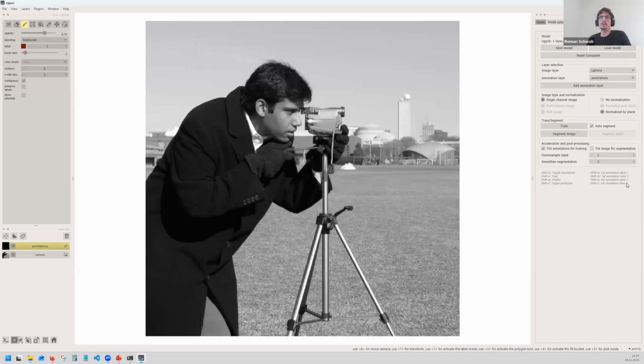For example, if you're a cell biologist and you have microscopy images similar to the one that I showed you in the beginning, it really depends on what you want to observe. Do you want to get the area of the cells in two different conditions? Then you only need to segment cells versus background. So that would make two classes. So you should use two classes in this scenario.